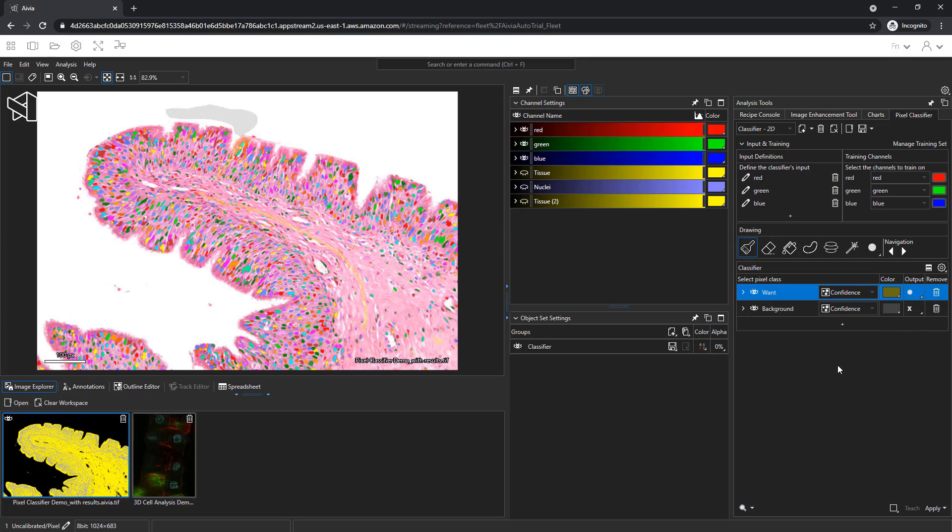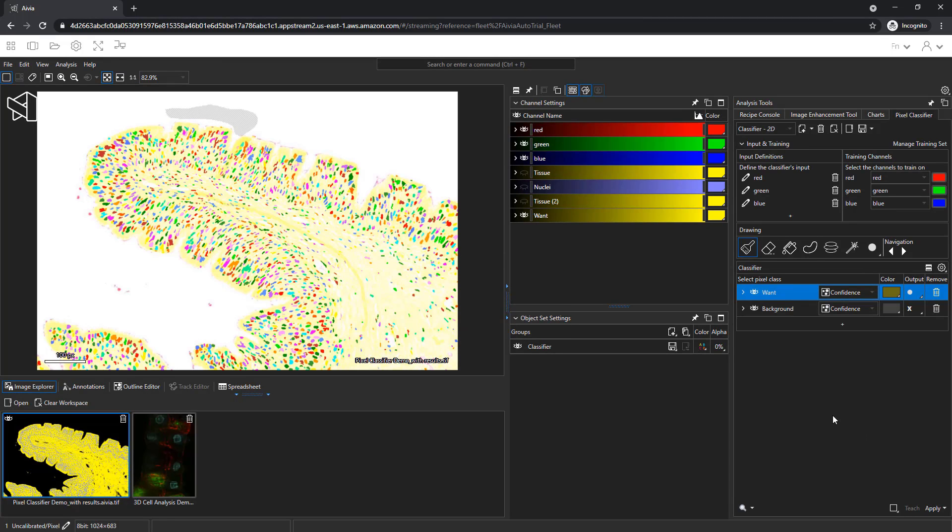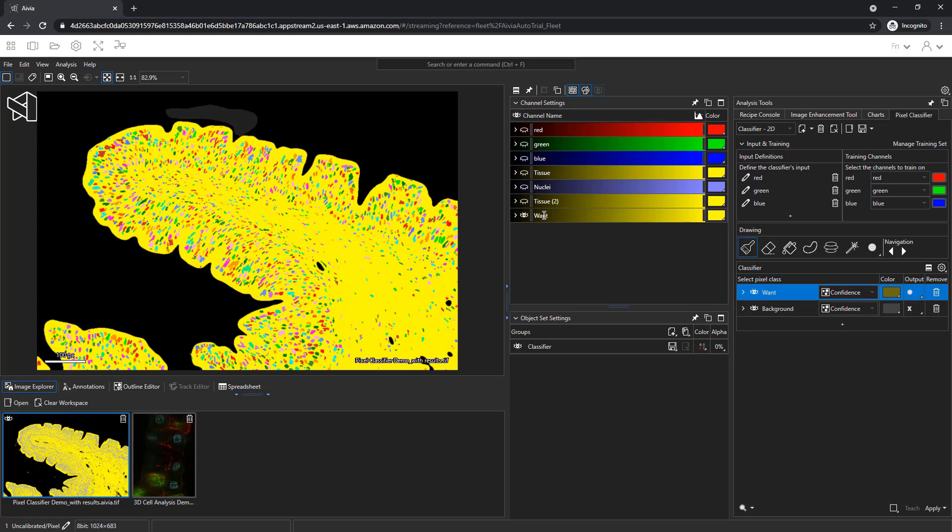We'll go with confidence for now. Click apply. The output is a new channel. Click on the want row to hide all the other channels.